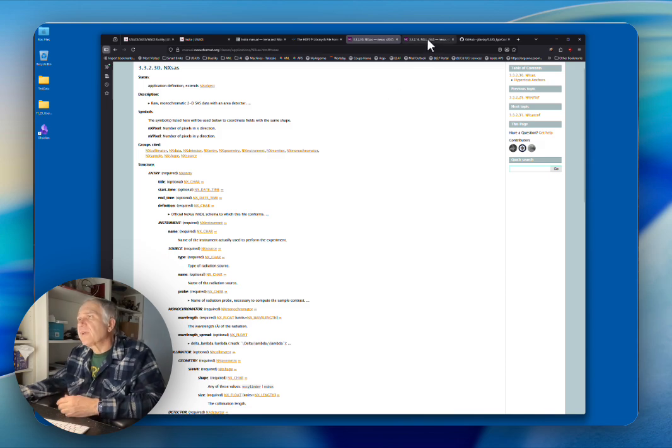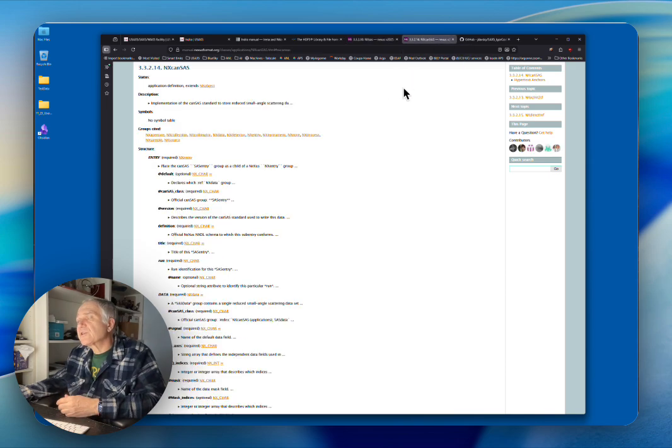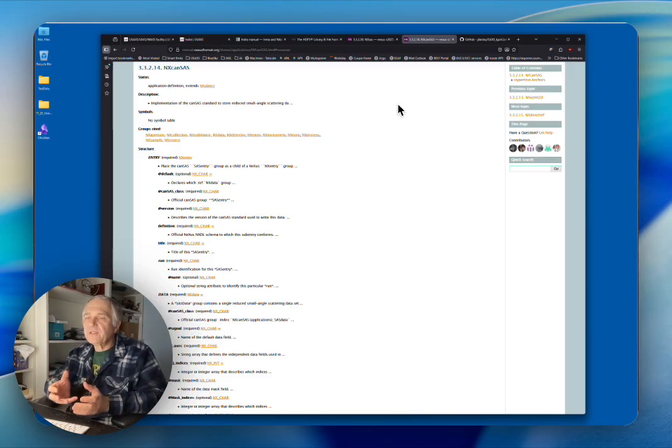We also have an NXcanSAS, which is a definition for reduced data for small angle scattering. You can attach to the same file raw data and reduced data, and applications can understand it. So if you have an application which is supposed to reduce the raw data, it can understand and pick up from that file the raw data, whereas if you have an application which looks for reduced data, it can pick the reduced data.